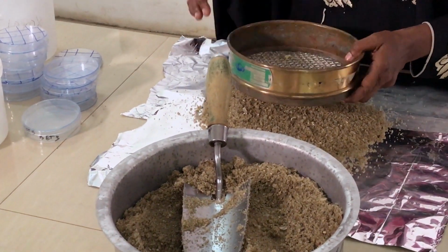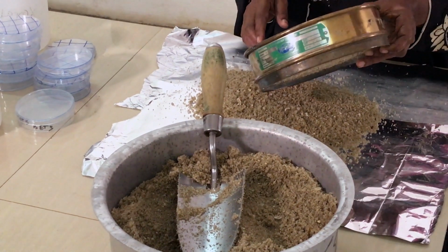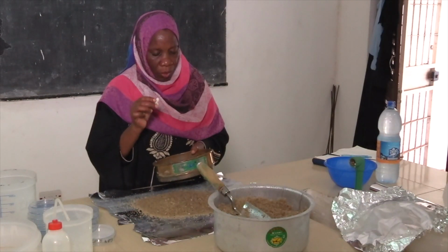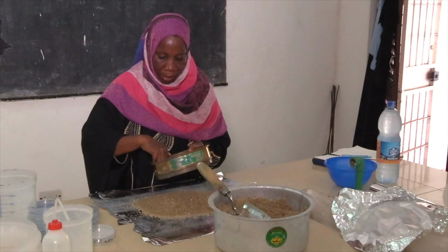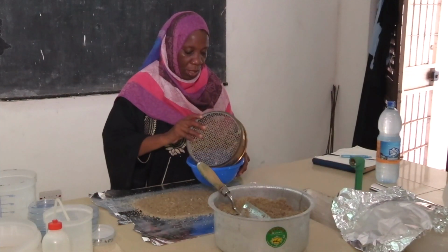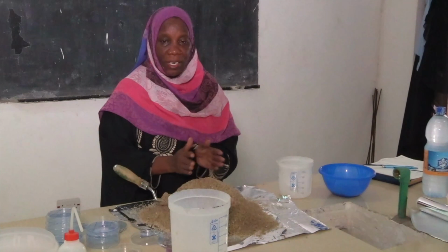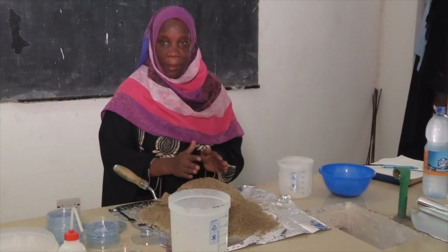And here you count the plastic. But now here we have only the organic material, which is not our concern, and the stone. This is not our concern. If there is no plastic residue, we leave it as it is. Now we have already sieved it through the 5 millimeter sieve plate, and we have our bag here.